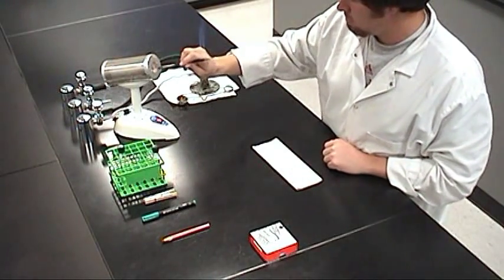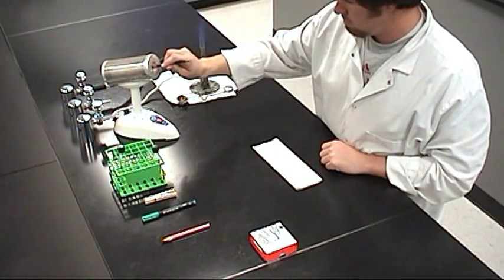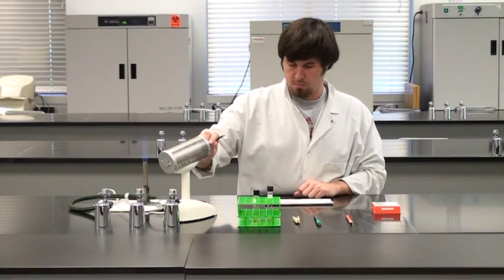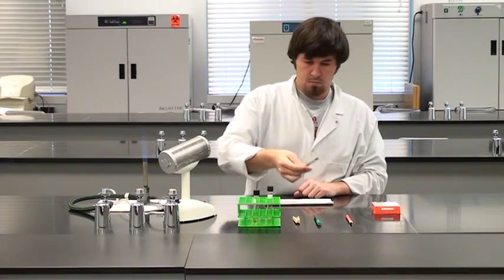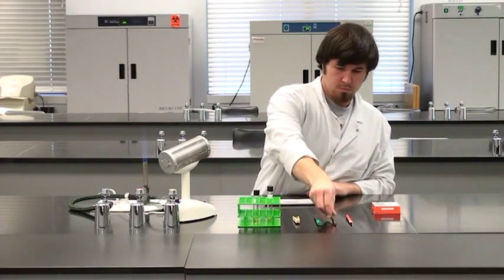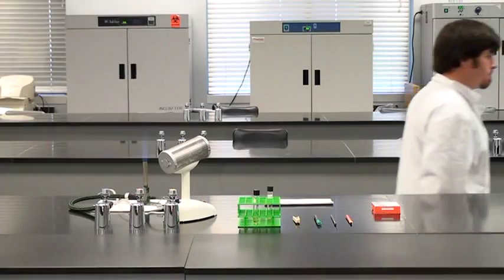Flame the loop one last time, then put it aside. Let the sample air dry completely to prevent distorting the size and shape of the bacteria during heat fixing.